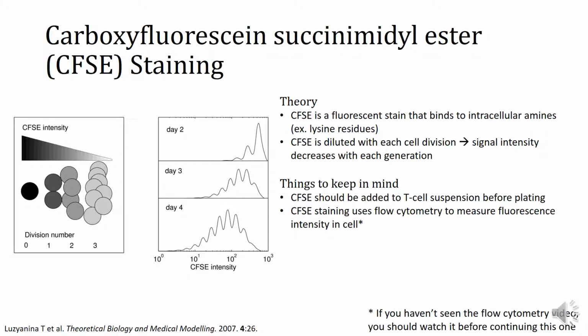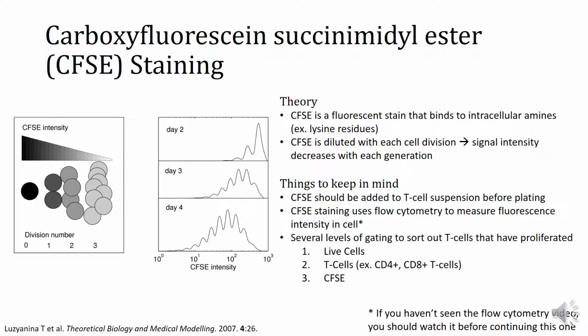So some things to think about when you're doing CFSE staining. You should add your solution of CFSE to the T cells before you plate them. And also, if you haven't watched the flow cytometry video yet, you should do that, because CFSE uses flow cytometry to measure fluorescence intensity in the cell.